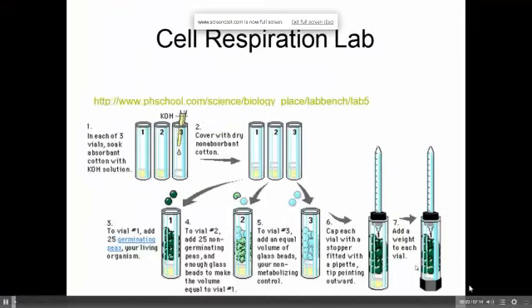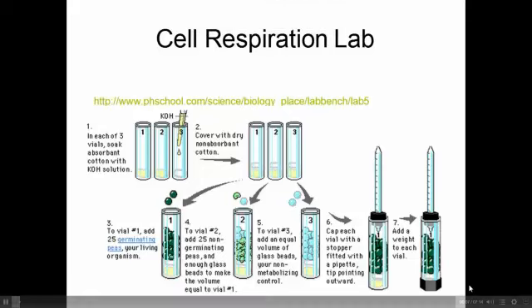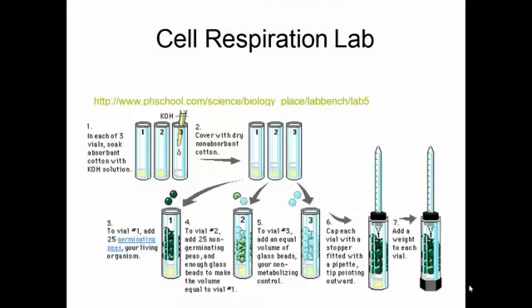We will be beginning the cell respiration lab tomorrow. We'll start by getting used to the setup and we'll run it on Friday. This is just a quick pictorial representation of what we're going to be doing. You'll have 3 vials that you're going to put together.